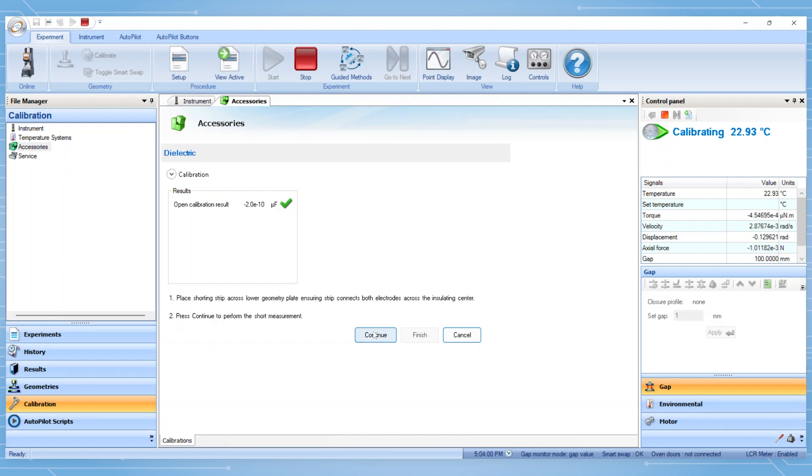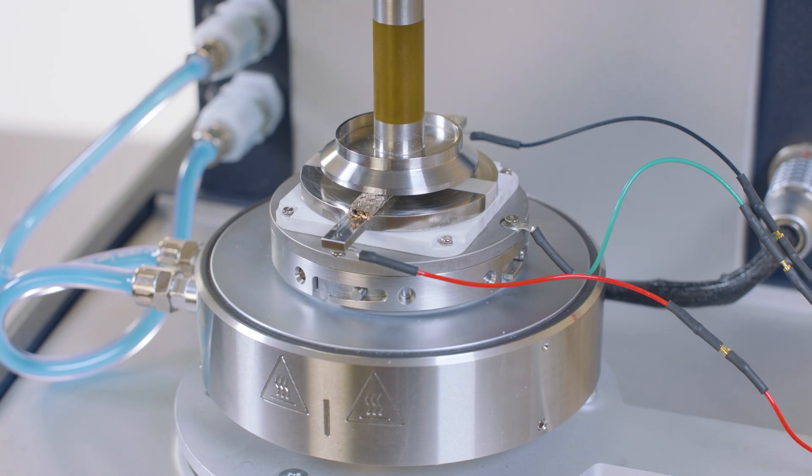To finish the short calibration, press Continue. The instrument then raises the head.